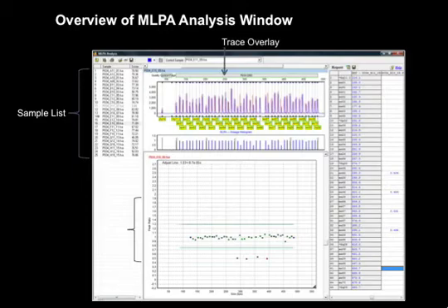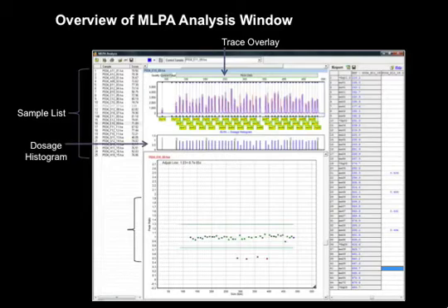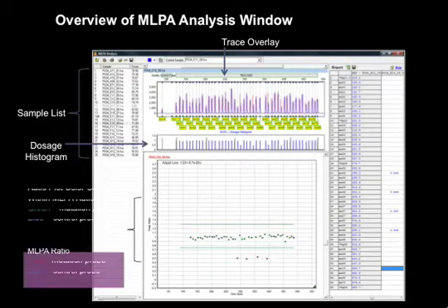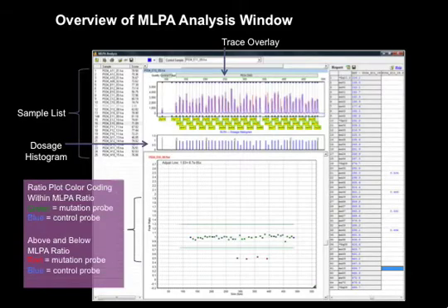Trace overlay of the red reference and the blue sample is located in the upper center of the page, followed by the dosage histogram and ratio plots. Color coding is used to indicate the type of fragment represented by a plot point. Blue equals a control fragment.